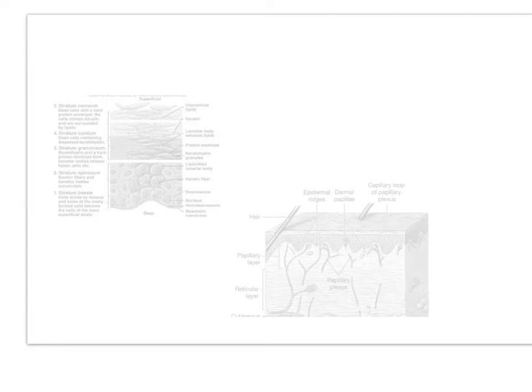And then if you move the slide all the way down through the reticular layer, through the hypodermis to the bottom where that brown tissue is, and now you focus on that, hopefully you'll see a bunch of striations in these cells, and this is the muscle that the hypodermis is attached to underneath. You see a very small layer of that. And if you move around, you can definitely, I hope, convince yourself that you see cells with striations. And so you have a small, thin layer of muscle cell attached there at the bottom of the hypodermis.